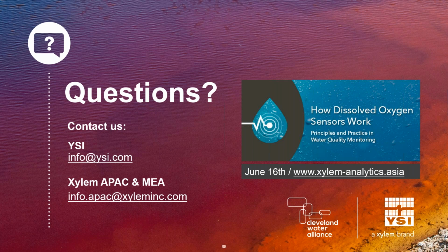Great. The next question is quite interesting. Does the temperature of the buffer affect calibration, or does YSI auto-correct for this? It is auto-corrected. As long as you have your temperature probe in there, and a lot of times it's integrated directly into the pH probe, you just have to tell it that that's pH 7, and oftentimes it'll even automatically detect that because of the millivolt ranges that we have defined earlier. That's pretty universal.